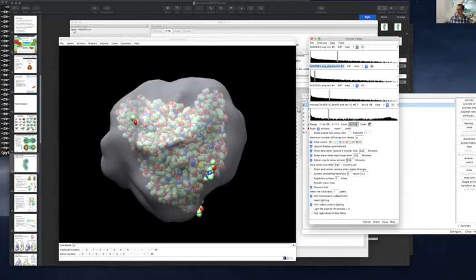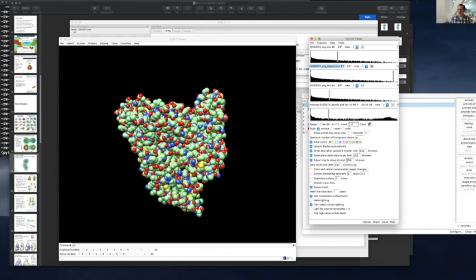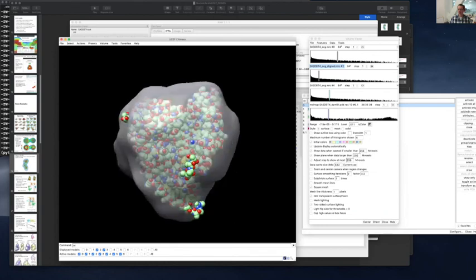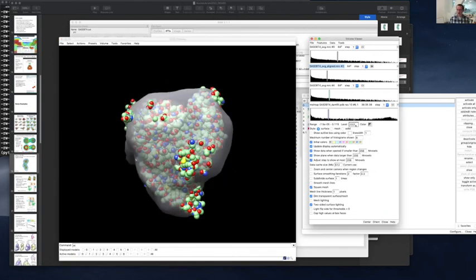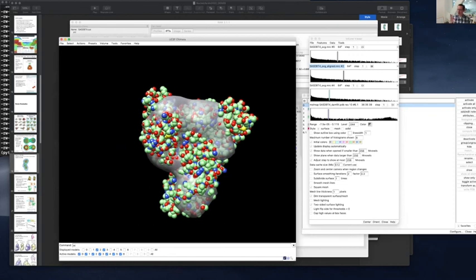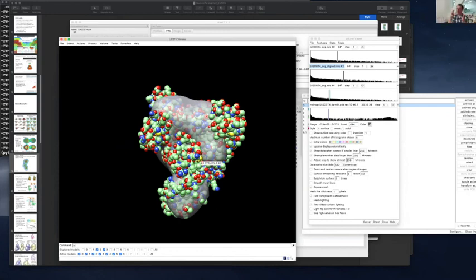But 0.011 would be 2 sigma, 0.022 would be 4 sigma, 0.044 would be 8 sigma. So you can see why I was saying somewhere between 5-ish and 7-ish sigma is usually a good estimate. But the idea is that when you're publishing this, you're going to have a few of them, right?